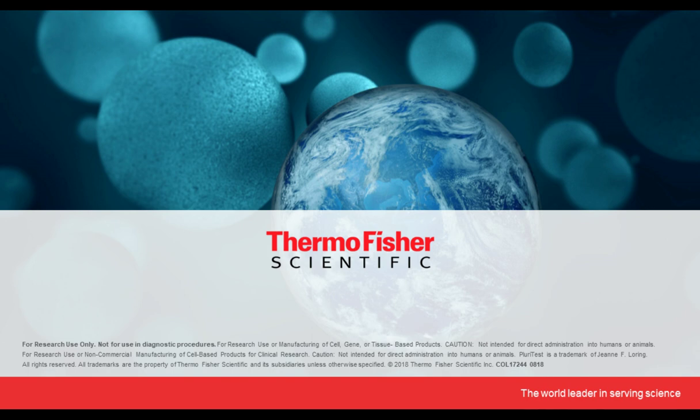That's a great question. So I think I touched on it a little bit. For the low resolution and high resolution assays, it's a matter of what level of safety you are looking for. Are you just doing a quick test before you develop your process further for differentiation? Then we recommend using the low resolution kit. However, if you're at the stage where you're doing clinical work and taking samples from patients that might be utilized or banked for potential therapies in the future, we highly recommend using the HD so that you can detect both the CNV and the SNP, and so you have real confidence in the insertion or deletion.